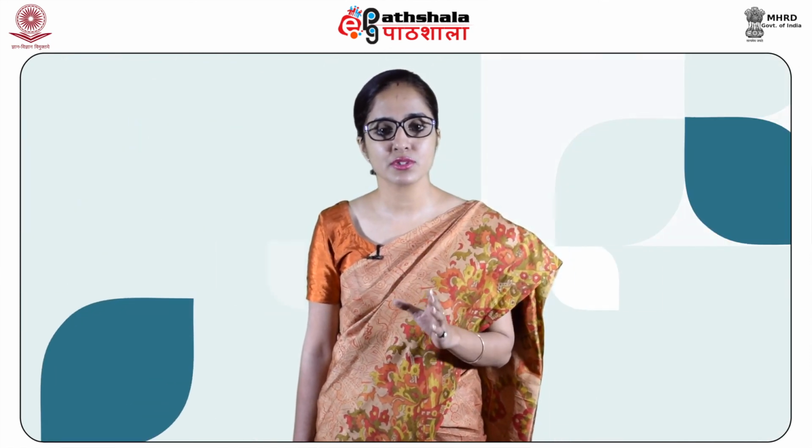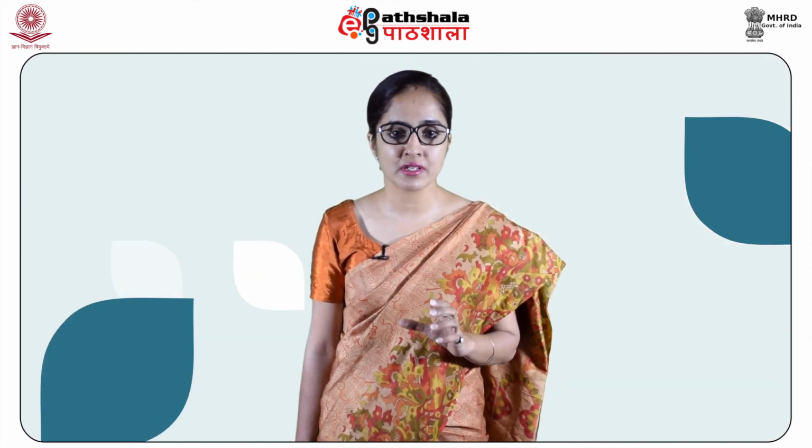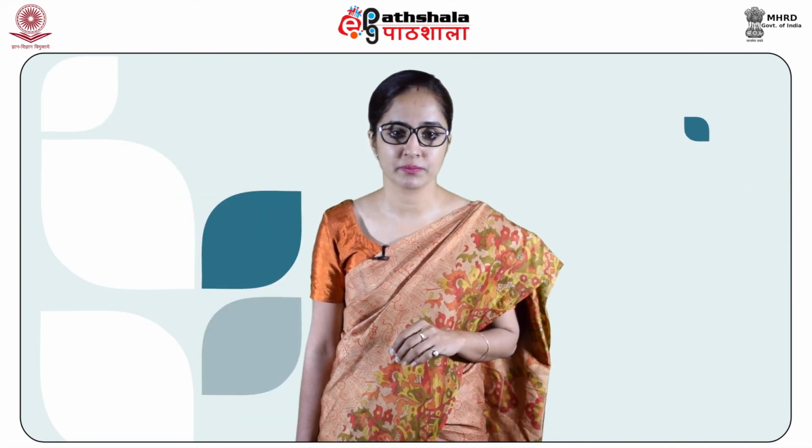However, if we have a terminal alkyne, that means the alkyne is at the end of the chain, the band may have moderate intensity, and this is supported by the characteristic CH stretching around 3310 cm⁻¹. A relatively low frequency CH bending vibration near 630 cm⁻¹ also confirms the terminal alkyne.